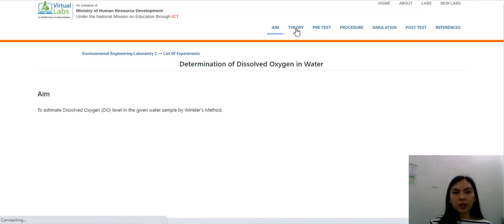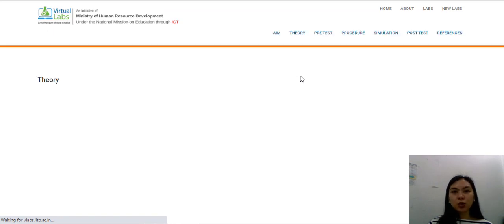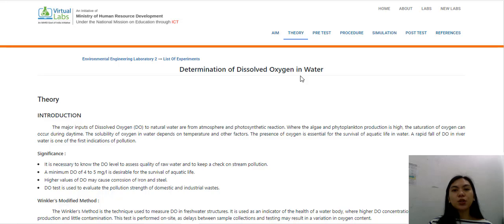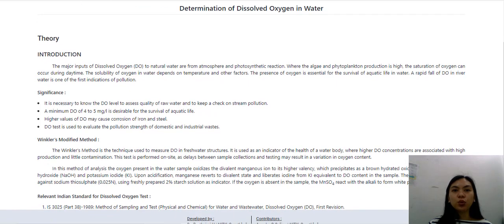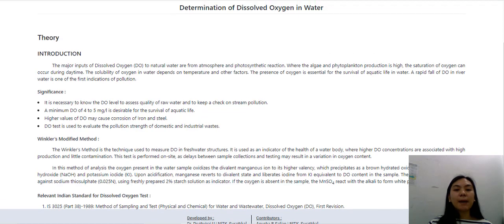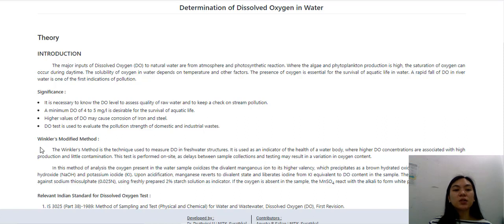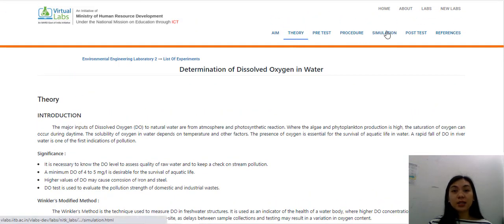Click on theory. This will show you a short theoretical discussion about the activity that you will be doing, and I encourage you to please read through this, as it will show you how important dissolved oxygen is in a sample of water. It covers the introduction, significance, and what is Winkler's method. Please make sure that you read this. Then after reading it, you go now to the simulation.